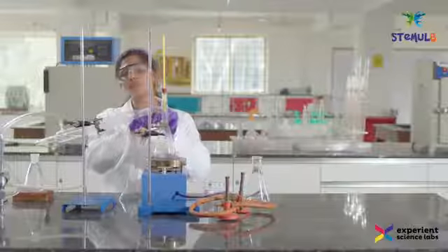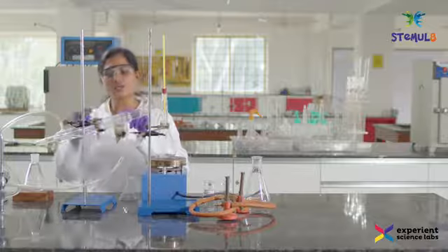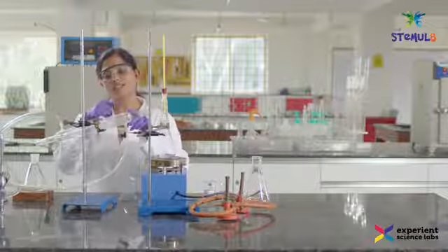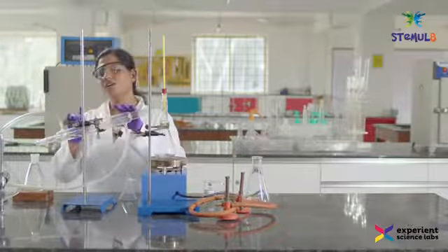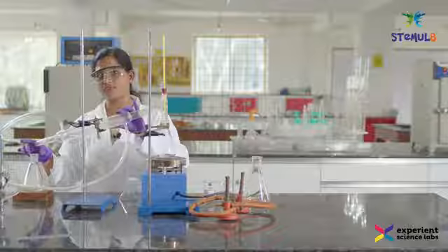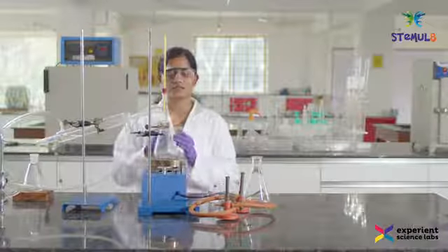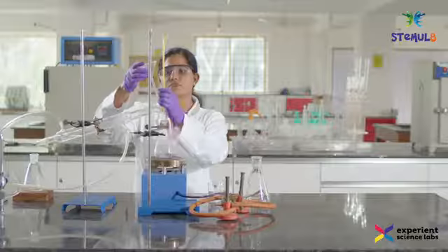The hot vapors pass through the inner tube. These hot vapors will be cooled by the water that is present in the outer tube, and then condensed and collected in the receiving flask. Let us now transfer the solvents with the help of a funnel.